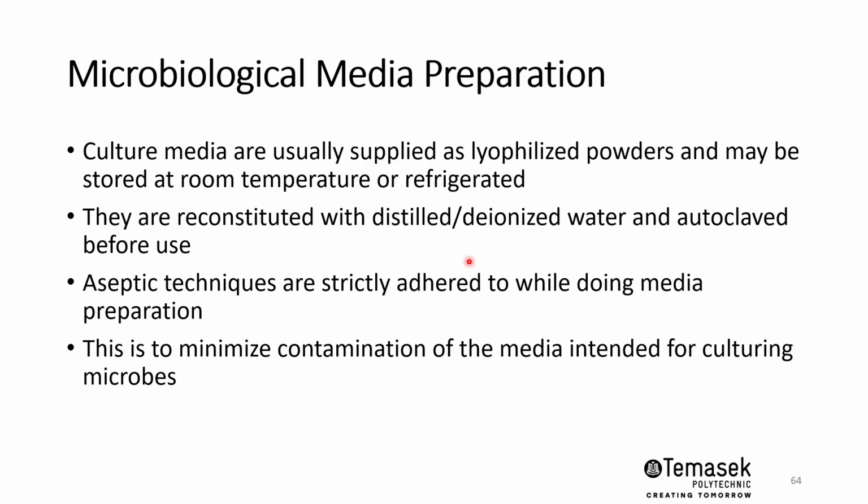So in the practical, you will be having the opportunity to prepare this media, such as the nutrient agar, right? While you are preparing it, it's important to adhere to aseptic techniques, because we want to minimize the contamination of the culture media intended for culturing the microbes of interest. So I have included some YouTube videos here to show you how we can prepare nutrient agar, as well as how to pour agar plates using aseptic techniques. So have a look.